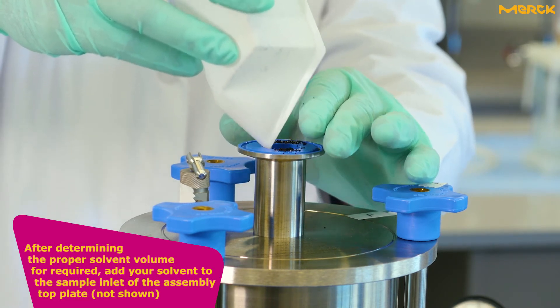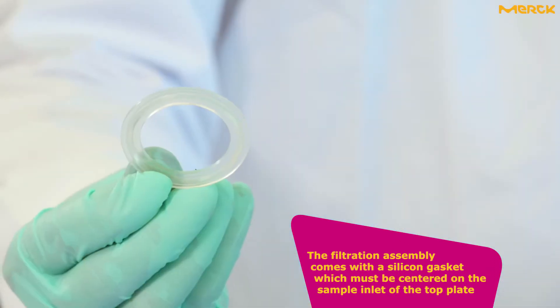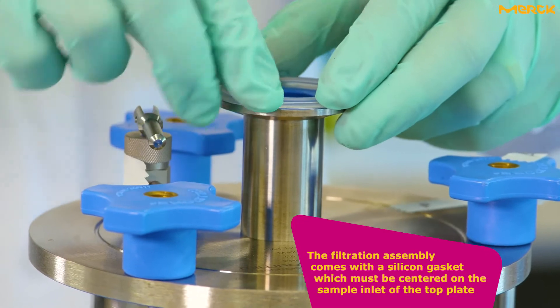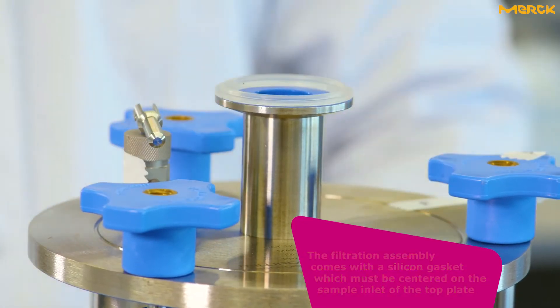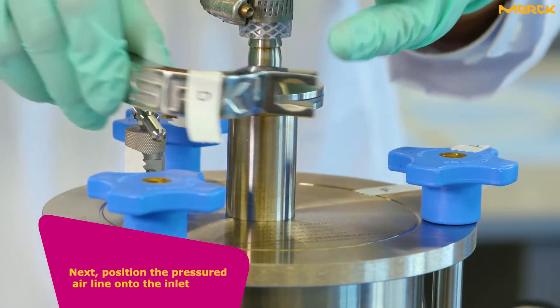The filtration assembly comes with a silicon gasket which must be centered on the sample inlet of the top plate. Next, position the pressure airline onto the inlet.